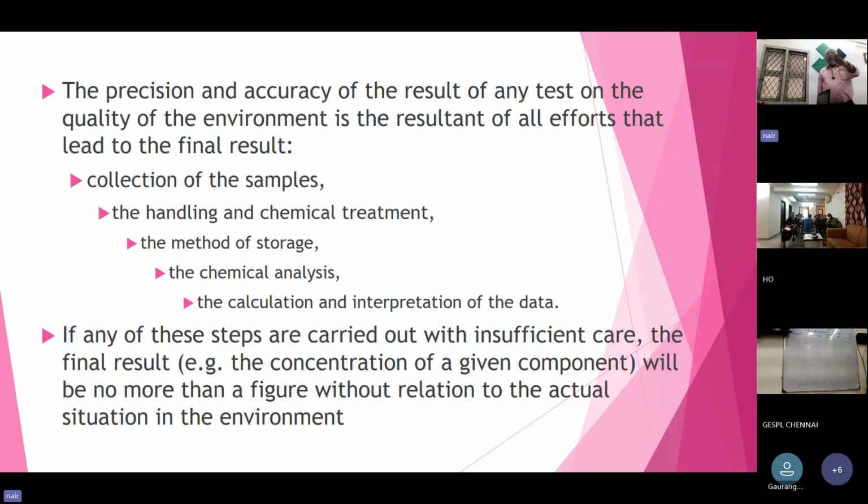Now in this session, I am not covering the chemical analysis and calculation, interpretation of data. That will be covered in the chapter, in part 2. See, all these steps are to be carried out with sufficient care. Very, very careful attention is required for this. So if any of these steps is carried out with insufficient care, the final result will be only a number. It will not give the actual condition of the environment.